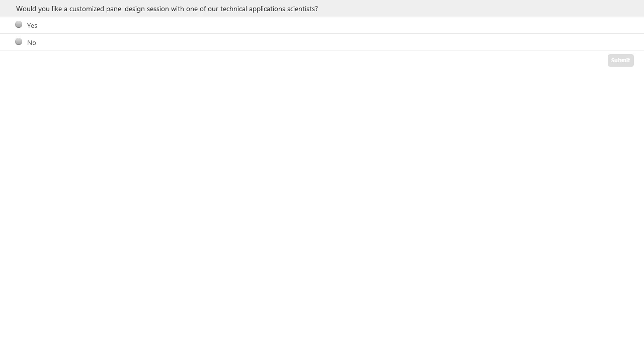Even within our own company, in what we've been working on in the spectral space at BD, we're learning and making sure of every different dimension, because one clear thing we know we need in this field is that the transition to spectral helps us in an analytical way in many ways.